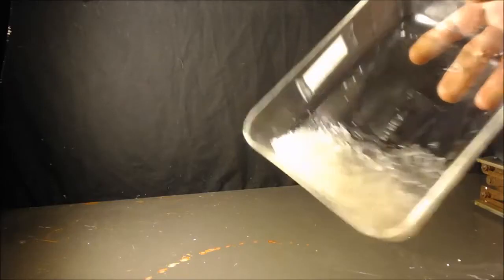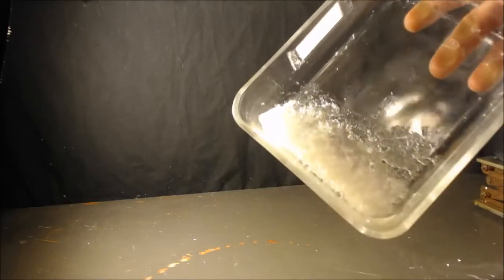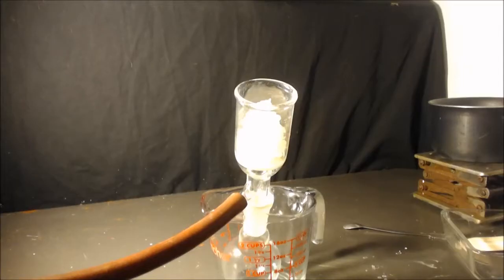There's my acetate, potassium carbonate mixture. I'm going to put it in here. And I'm going to suck all the water out.